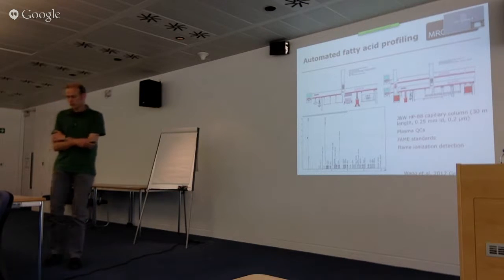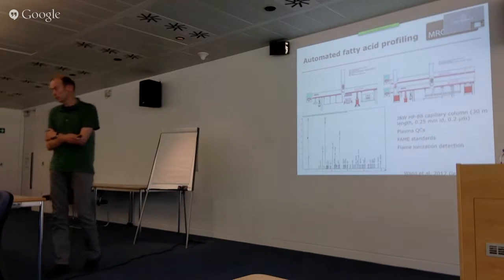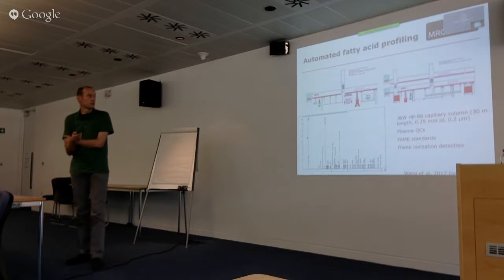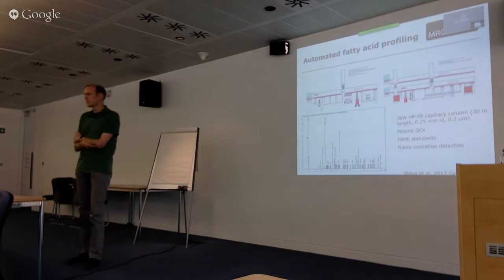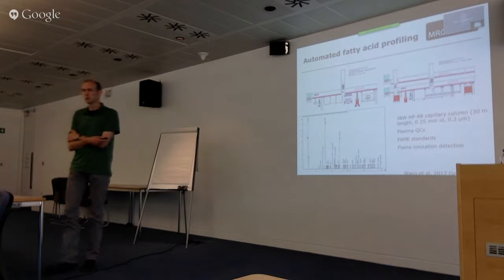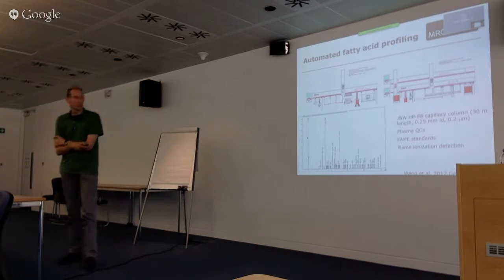So the first big projects we started using this GC, and like I think Jake mentioned, NMR. This is a type of technology that doesn't produce much data compared to the mass spec machines, especially because we use just flame ionization techniques.